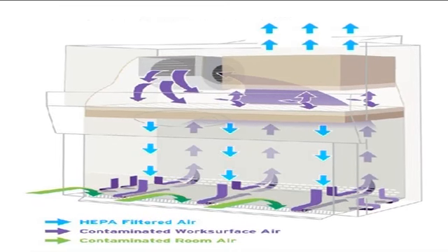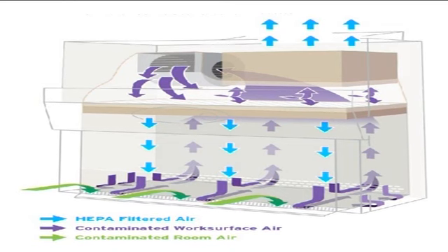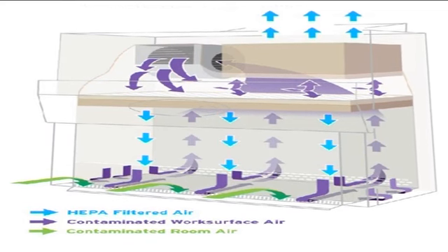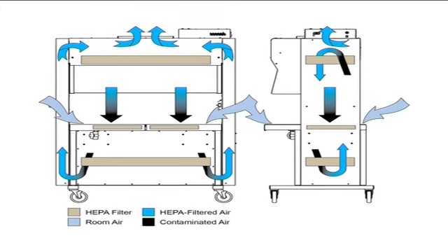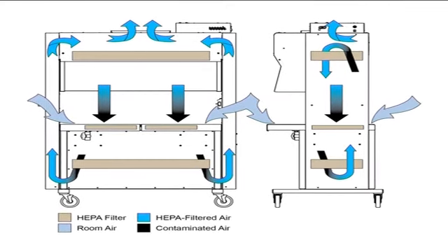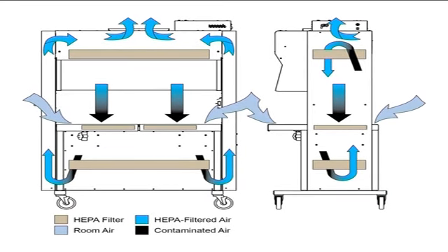In general, the unit consists of a bank of high efficiency particulate air, that is HEPA filters, enclosed in a cabinet or hood. The air stream at descent velocity moves essentially in a parallel pattern, so that the cleanliness of the air is independent of activities occurring down or cross stream. Undoubtedly, laminar airflow is the most important part of the laminar flow clean benches to provide an environment free from microorganisms moving toward the workspace with excellent and consistent results.